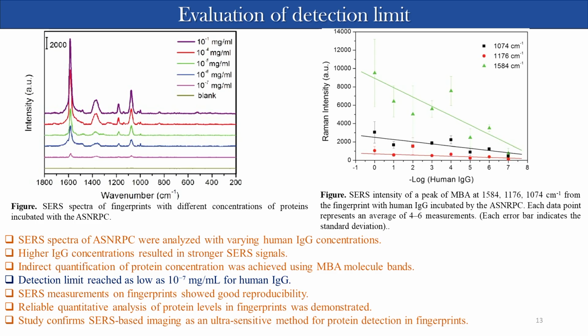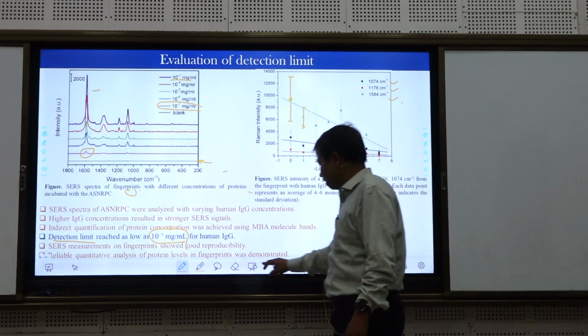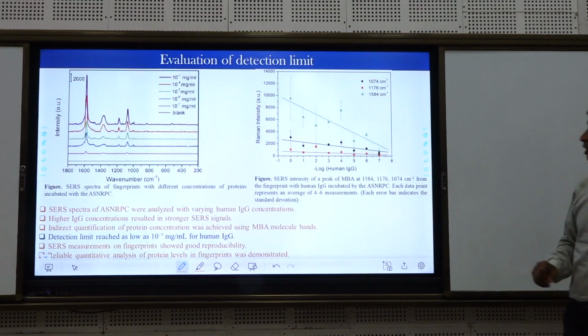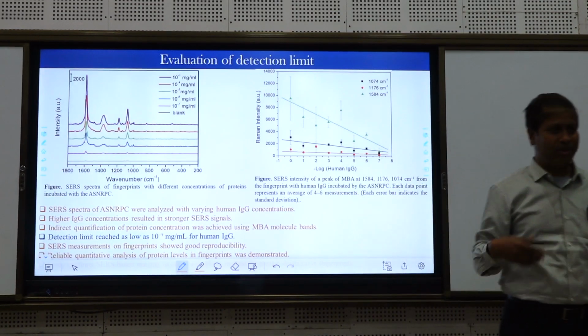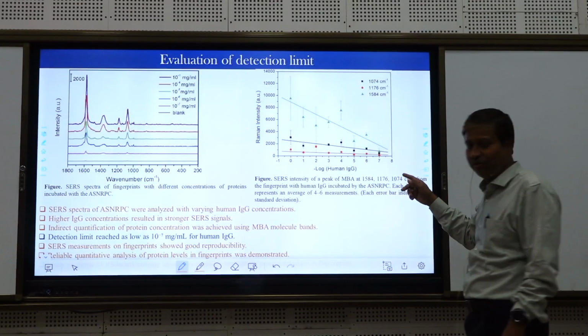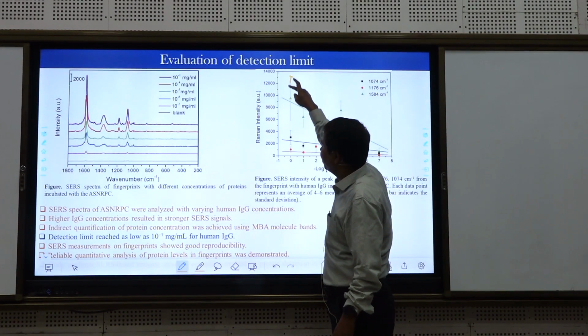Error bar. Yes, these are the error bars. Error bars are very much necessary if you want to make your data convincing, because if the error bar is large like this, then that data point needs to be repeated. The data point does not have much confidence. So one will not give much confidence to this data point.